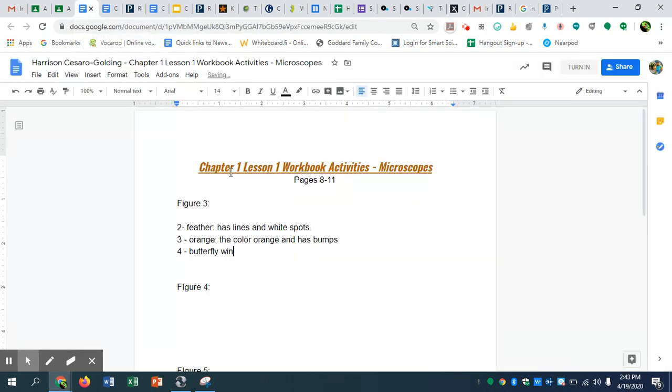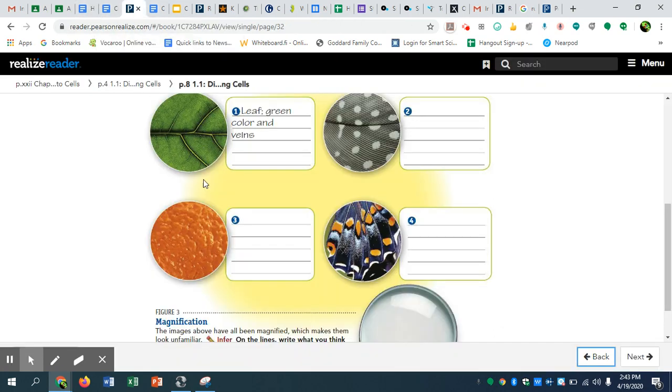Okay. So butterfly wing. So oh God, I got to write orange again. Has orange. Again, I'm 0 for 3 here. O-R-A-N-G, orange spots and black and some lines in it, kind of like see the folds in the wing. Okay, so that was our first activity.